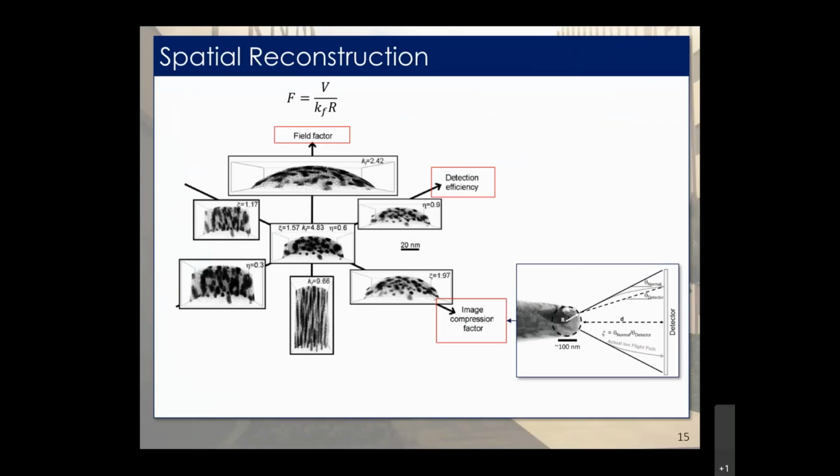But at the same time, there's a lot that we can do to make sure that we can trust our atom probe data. First of all, as a general caveat, in this case we're clearly taking these factors to extremes to show their effects upon the material. A material is not always going to be as sensitive as that. But there are a lot of things we can do to help build our reconstruction so that we know we're not completely out in terms of its veracity.